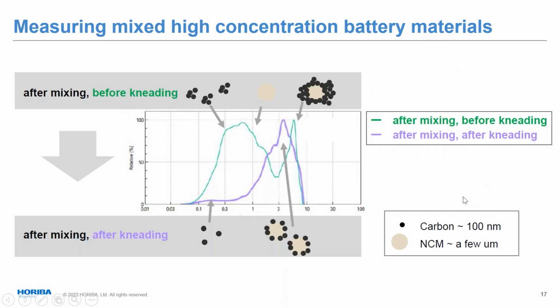Here's another example of what we were asked to analyze by our customer. This is a battery application. In this particular application, you had a center core of a particle, which was surrounded by some carbon. Sort of looks to me like what I would have thought of as toner. And of course, the big question with this and with toner as well is you want to know what's actually in the bottle that you're working with.